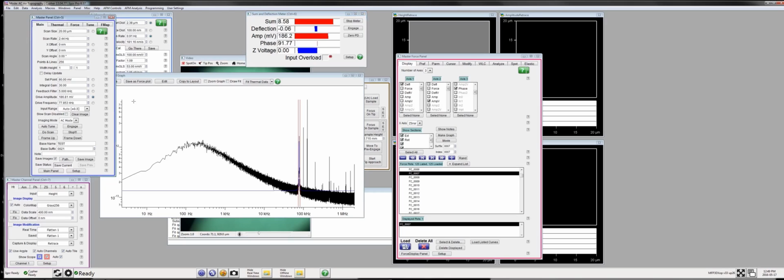I want to use about 10 nanometers or less for approaching, because I assume that the tip is sharp. I want to use very small amplitudes, so 0.1 volts times 53 is about 5 nanometers of free amplitude. That should be enough, small enough.